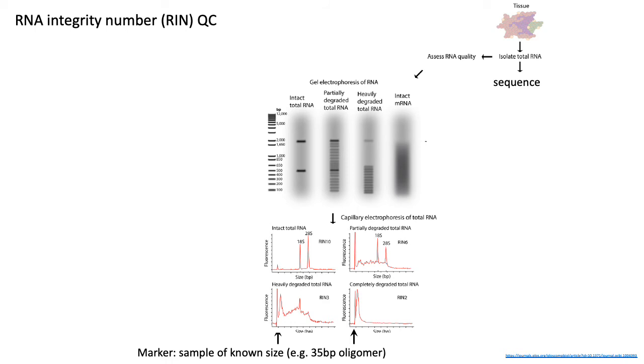As the RIN number decreases, you can see a higher frequency of smaller fragments. That essentially indicates heavier and heavier degradation. For example, at a RIN of 2, you can't see any 18S or 28S peaks, which, if you're looking at total RNA samples, is what should be composing the bulk of your RNA. So a RIN of 2 would just tell you that your sample is pretty much garbage. Similarly for a RIN of 3, there's a ton of noise in your total RNA sample, and it probably indicates that you should just go and collect another sample.